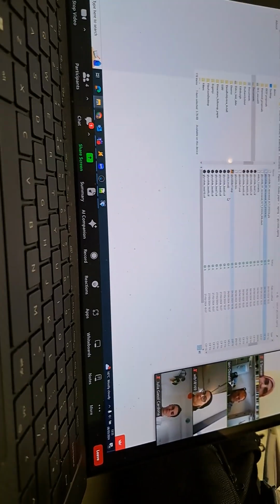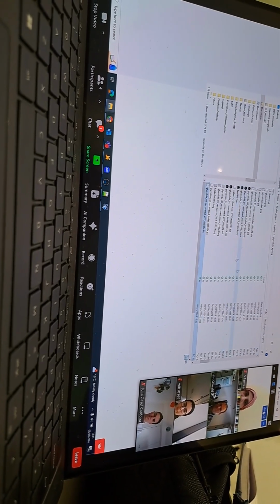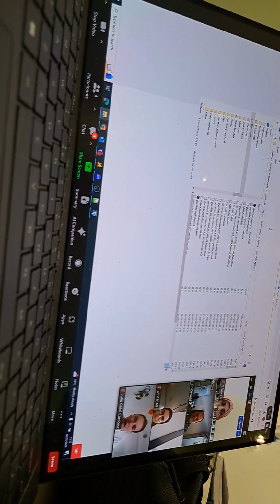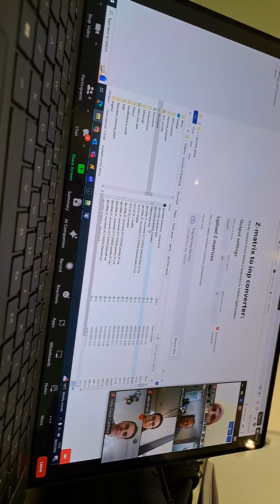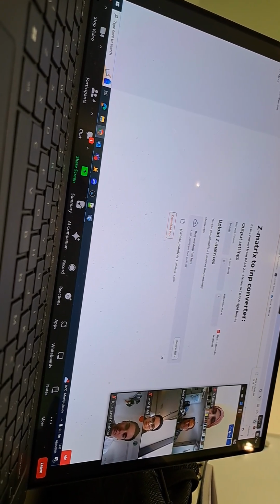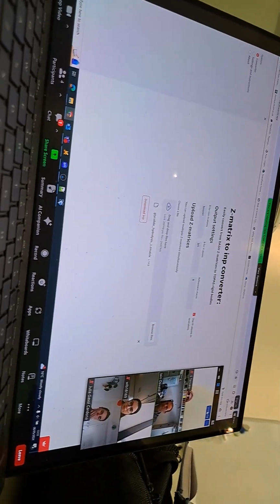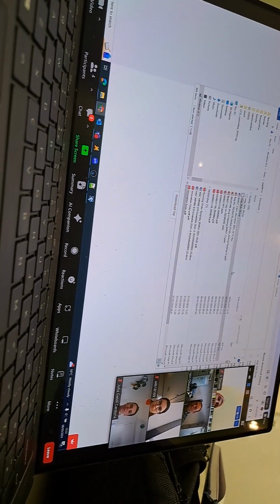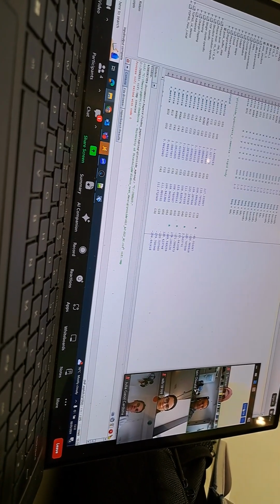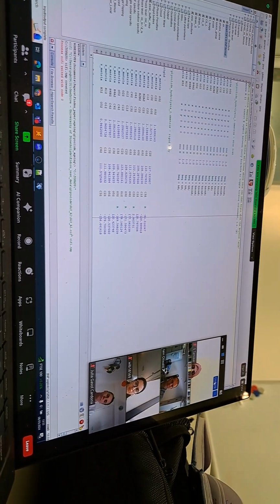What's it called? So the Z matrix, we're just going to pop in there. Then with IMP, open that thing up. So we've got our Z matrix in here. And once Z matrix mapping is complete, delete all the oh, that's a bit of a step ahead, isn't it?